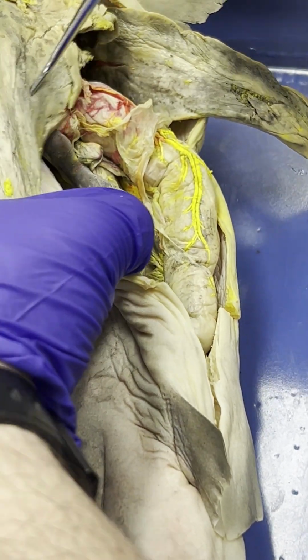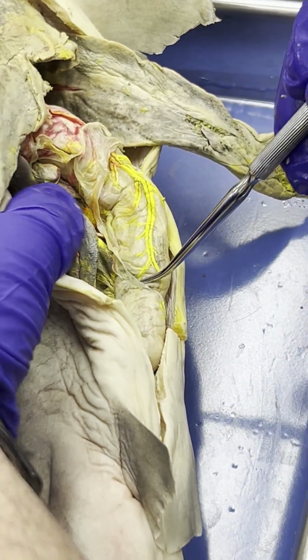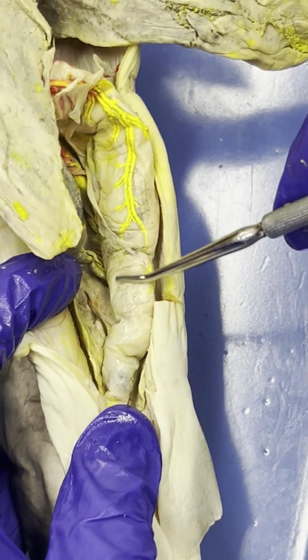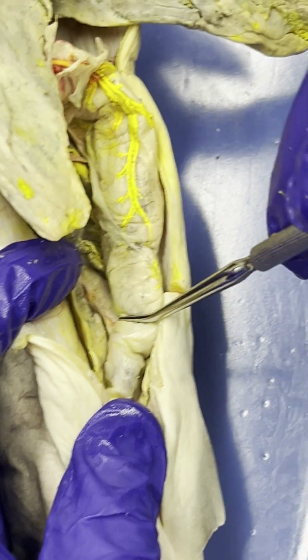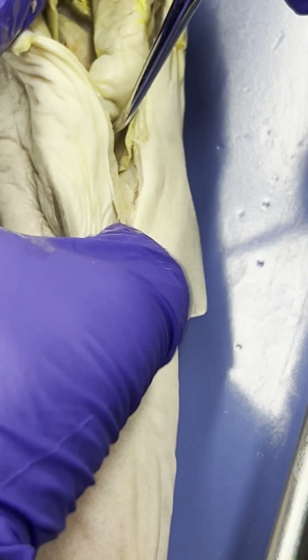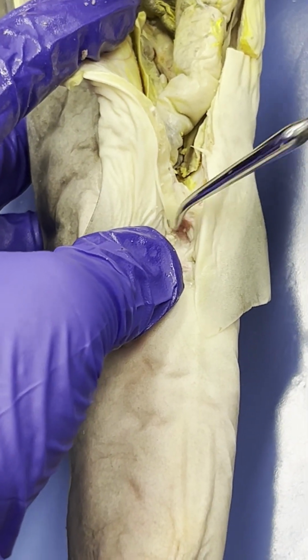So duodenum, valvular intestines, and then we're going to get to the colon, which is right here. Actually feels like there's something in there. The colon, and then after the colon is going to be, remember, the all-purpose chute or the exit hole, which will actually be the cloaca.